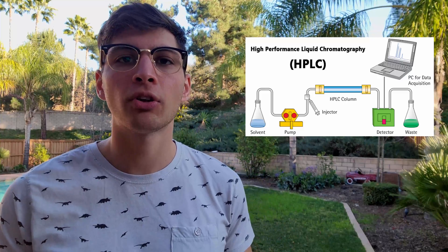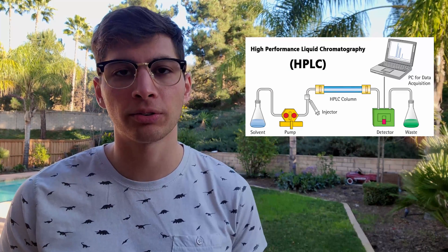A high-pressure pump pushes a solvent through a column that's packed with solid particles. The solvent and solid system, called the mobile and stationary phases respectively, are carefully chosen so that your chemical of interest sticks to the column for a longer period of time than other chemicals. If you vary the flow rate and composition of the mobile phase, you can elute or wash out your particular chemical at a specific time point. This technology is used in research and quality control fields. In my research, I use it to identify compounds that yeast produce, but it's also used for many other biological and chemical applications.